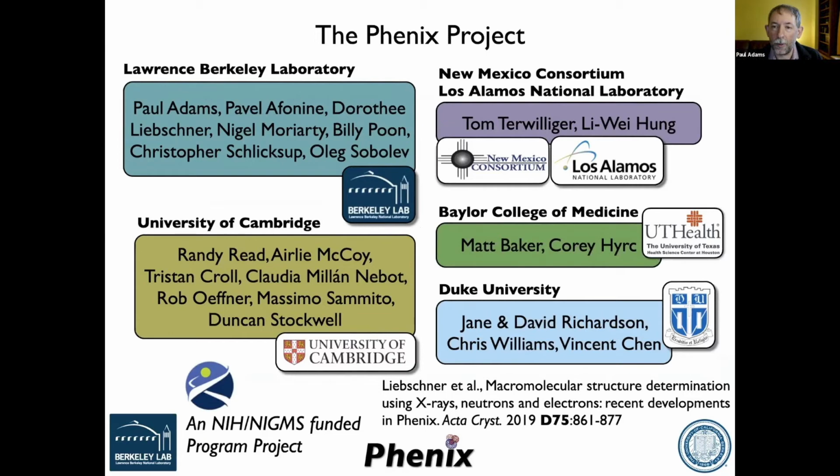In our favorite horrible structure, they actually annotated the helices quite correctly. But if you run DSSP or Ramachandran on them, that will not be correct. So if you did it right, it should all go together the way you were saying. But if you think it was really an alpha helix, but you fit it with a peptide around backwards, you should fix that peptide, and then your annotation will come out right.